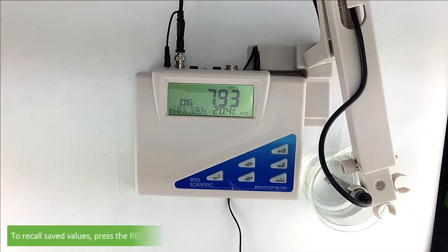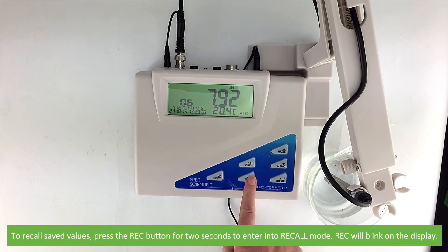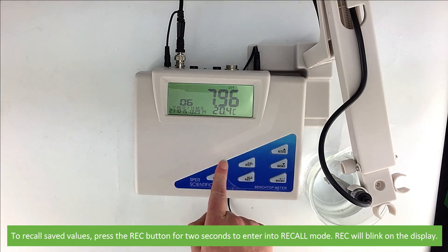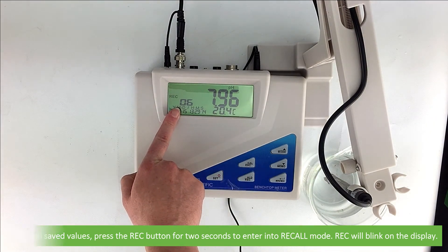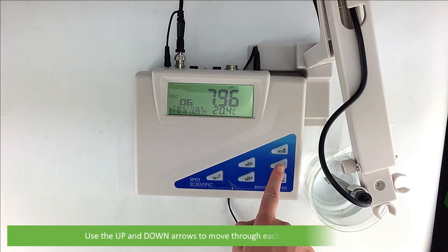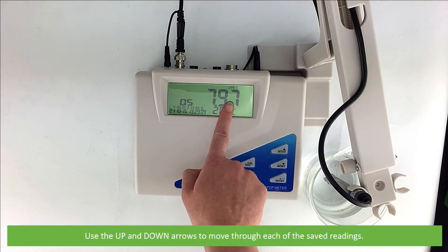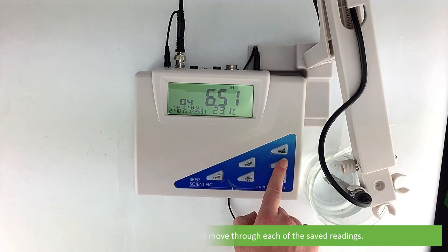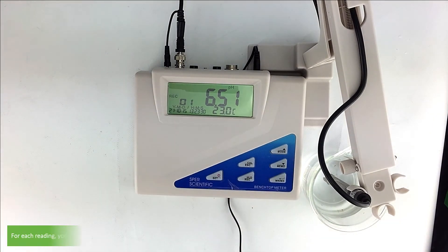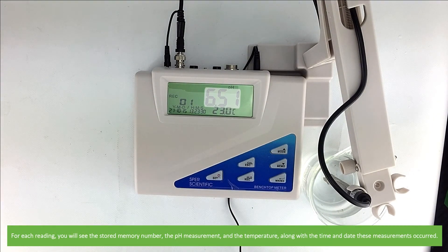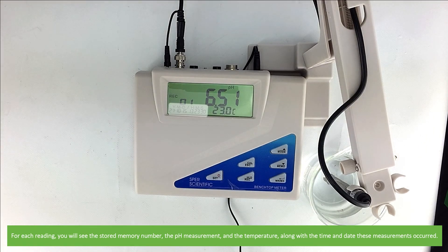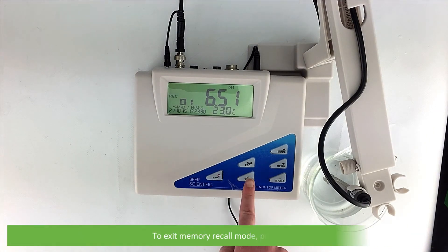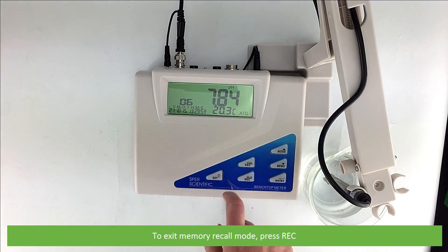To recall saved values, press the REC button for 2 seconds to enter into recall mode. REC will blink on the display. Use the up and down arrows to move through each of the saved readings. For each reading, you'll see the stored memory number, the pH measurement and the temperature, along with the time and date these measurements occurred. To exit memory recall mode, press REC.